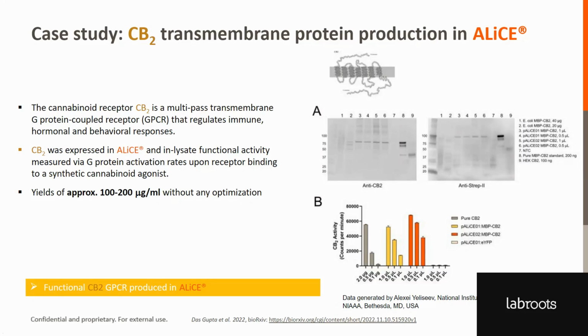If you're working with other systems, you can see in the literature, especially the E. coli systems, people are supplying all kinds of lipid interfaces, lipid matrices, nanodiscs, detergents, so that the membrane proteins, as they express, have a platform in which to embed. But because we have these native microsomes, we didn't need any optimization and could produce this functional GPCR within a 2-day reaction. This is super important for the drug screening industry, for example.